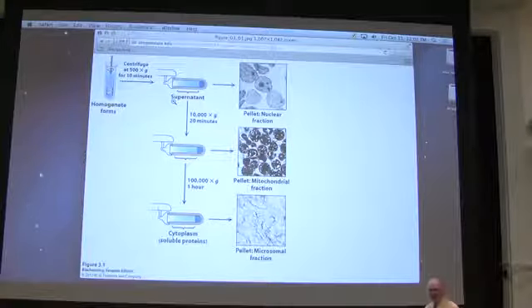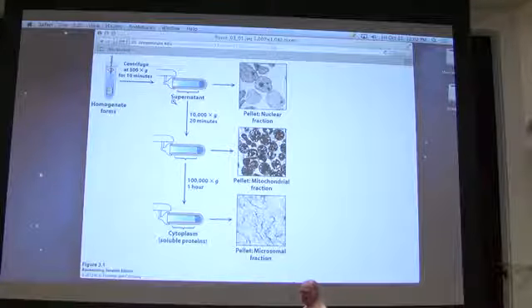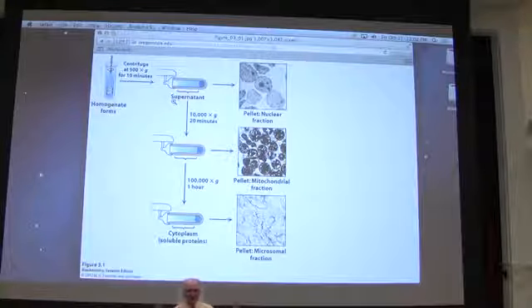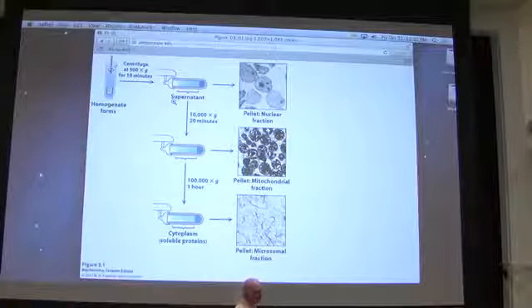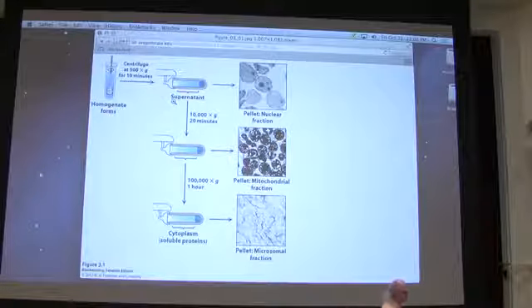You'll see there are some shortcuts that work fairly well. Other times those shortcuts don't work well. So there's no one way of isolating molecules. So some molecules take a lot of steps. Some molecules don't take so many steps. And I'm hoping to acquaint you with some of the steps in this process.